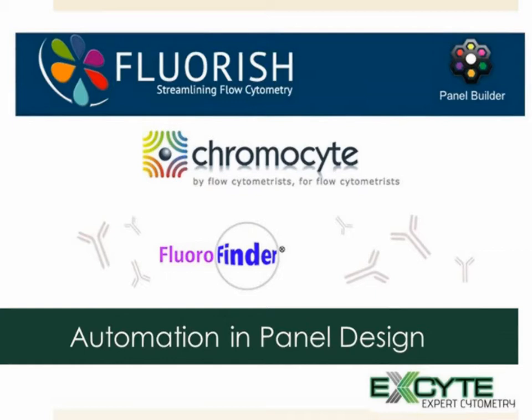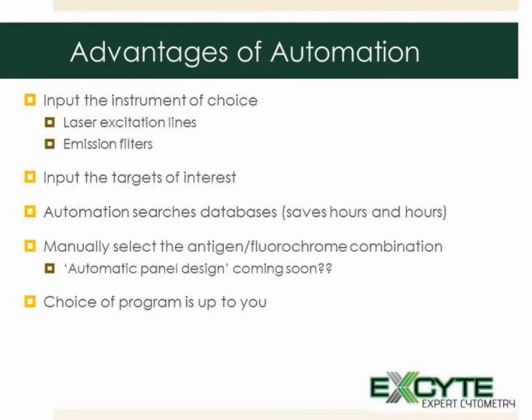And if you haven't tried one of these programs, I would encourage you to take advantage of them. All three are free for academics. If you're a commercial entity, you'll have to talk to the different companies to find out how they work that. But I have found that these programs save me countless hours of searching through databases and really speed up the process of panel design in an automated fashion.